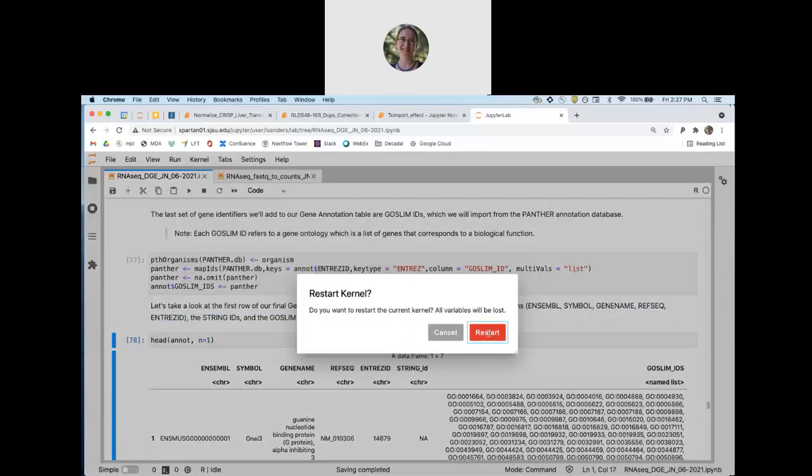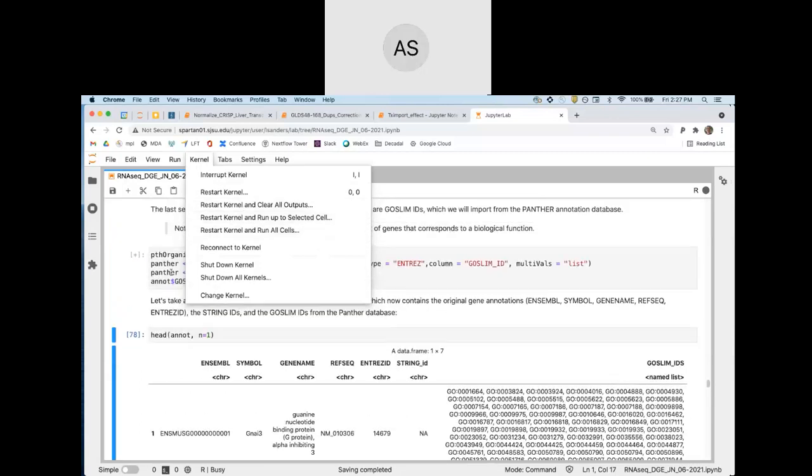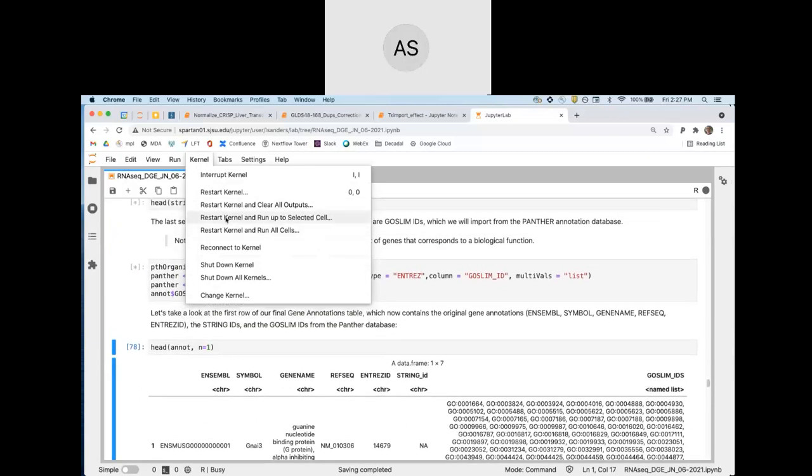And then just a reminder for those of you who didn't put those hashtags next to those DDS tests that we did, make sure you do that before you run, or else it'll stop there because of an error. Yes, thank you, Amanda. Good point. Let me know if you are running into issues.